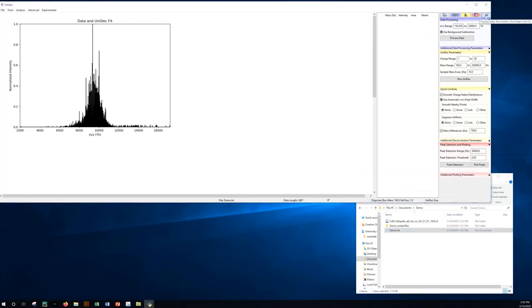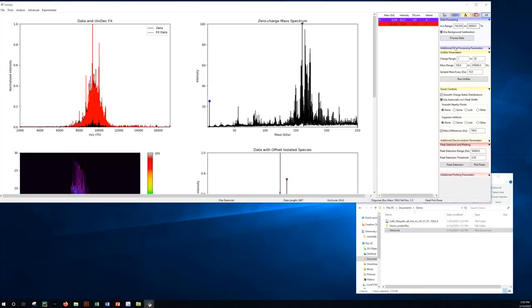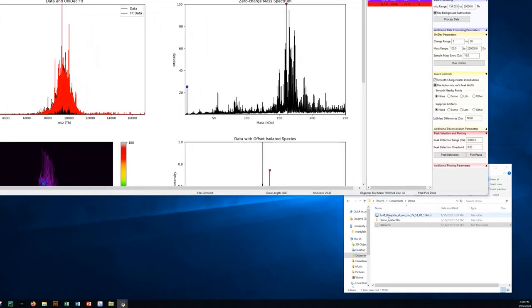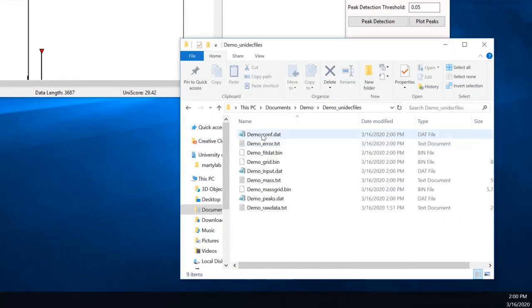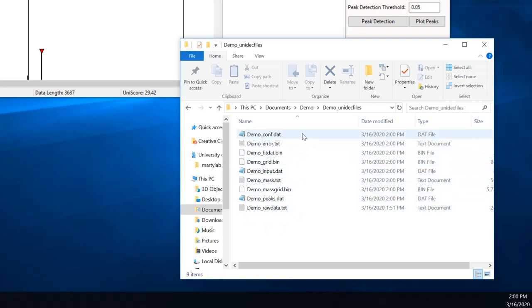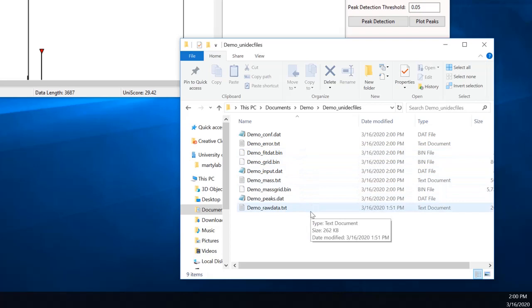The advantage of doing this is that once the data has been processed, Unidec creates a Unidec Files folder which contains configuration settings and the raw data. It also contains text files for a range of other program outputs, including the deconvolved mass spectrum and peaks.